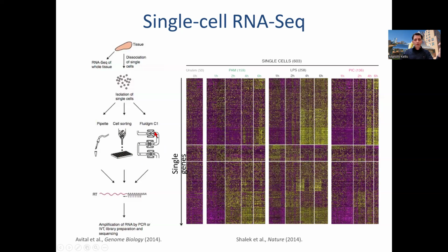And there are technologies that allow you to encapsulate every cell in a microfluidic droplet, which allows you to capture individual cells in reaction chambers that are not the size of a test tube, that are not the size of a plate with 96 wells or something, but are instead the size of roughly one cell, where those reaction chambers are made out of little capsules, little droplets that are encapsulating those cells.